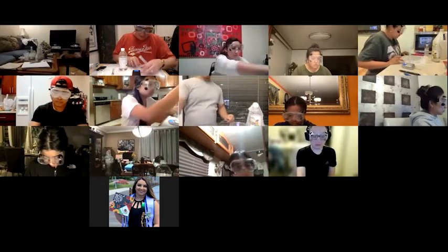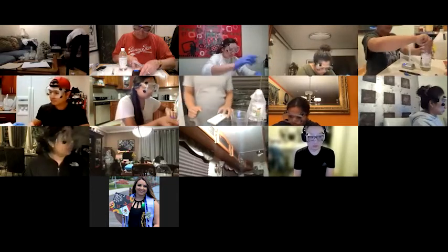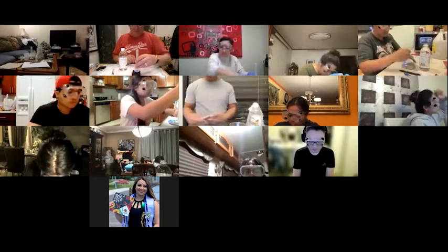Oops, I got grains here. That doesn't help. Why do I get grains? Grams, there we go. Wow, so 11 grams right on the nose.